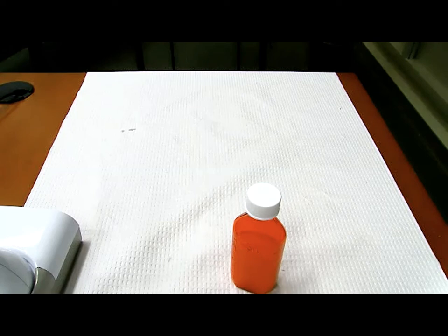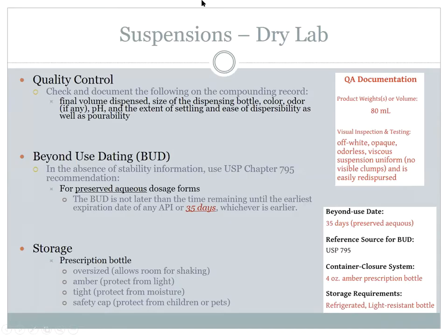Okay, am I back at it? All right, I think we're back together. So QA, we got the right volume at 80 milliliters. Now, it's kind of a pain to describe this. We do expect a lot from you in terms of how to describe the suspension inside the bottle.